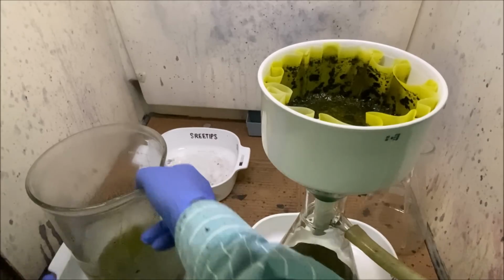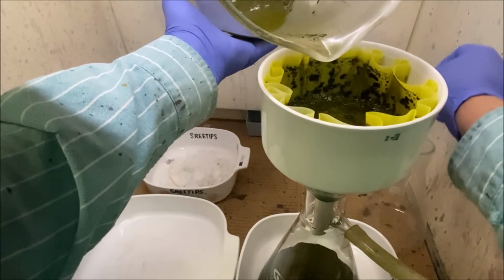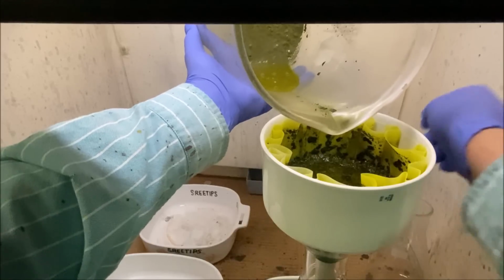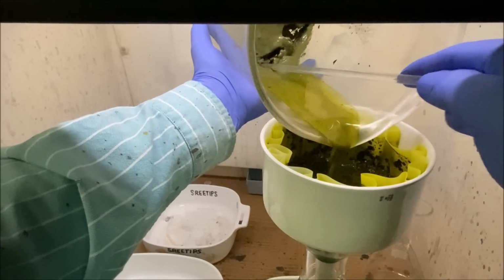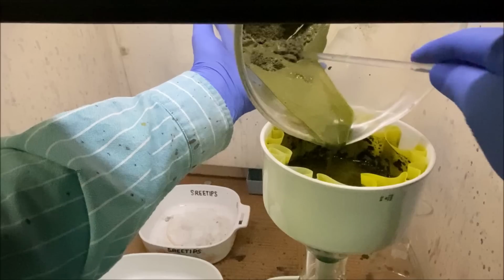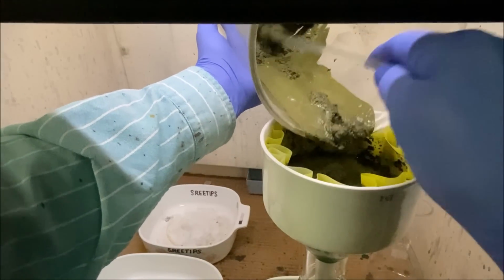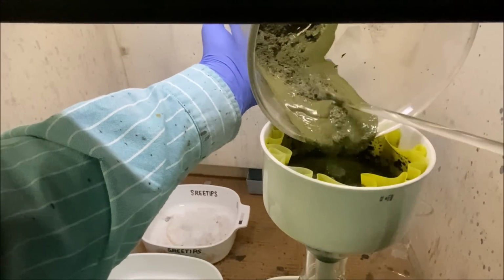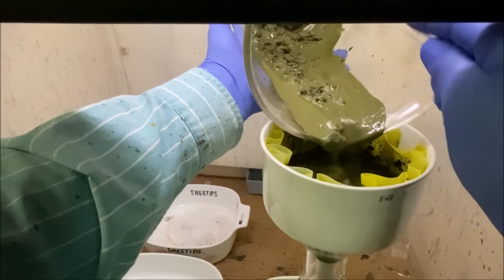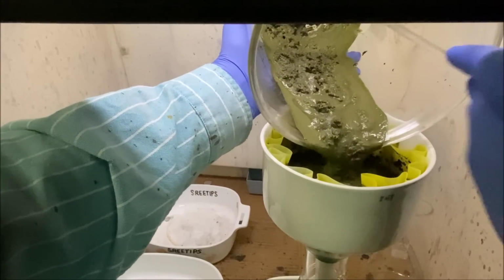So what we're going to do is we're just going to try to scoop these solids and heap them into the filter. And then we'll try to rinse all of the gold solution off that's bound up by those solids as best we can. I've got a little bit of experience with the jeweler's scrap here, and what I've noticed is this first aqua regia extraction will yield the highest amount of gold from those solids. Probably over 90% of the gold will be recovered here in this first aqua regia boil.